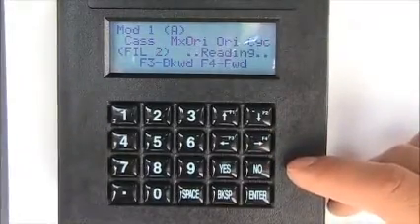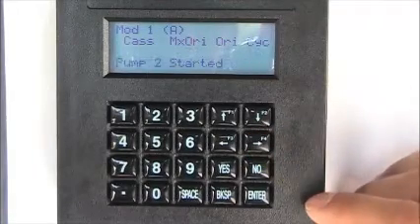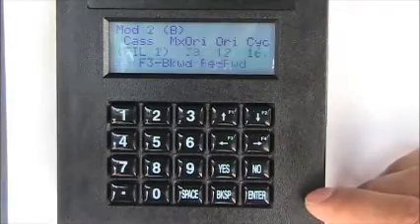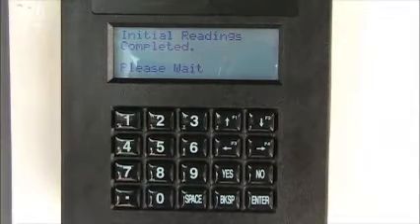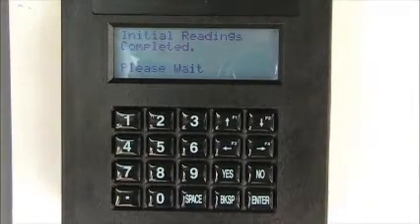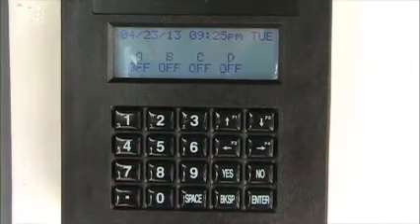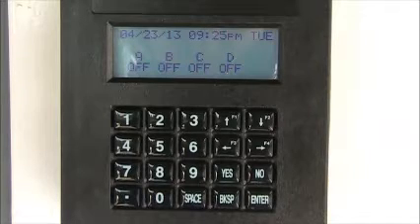Please notify an AQG technician if the max ORI drops below the listed number on the sample log sheet, if you get a low flow warning, or if any of the other values are not within range of the posted sample log sheet values. Once you are finished cycling through initial readings, the keypad should read initial readings completed and take you to the default menu. The controller should always be left at the default screen. This completes the sample change for week 1 of a 232 box.